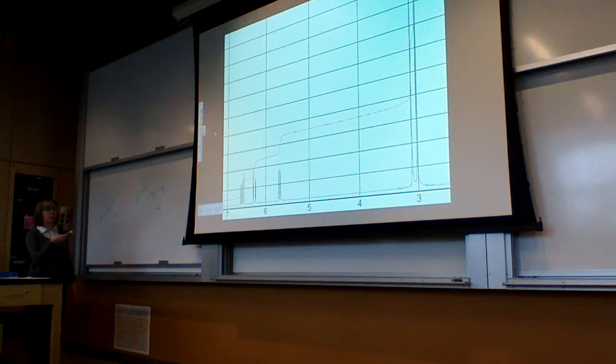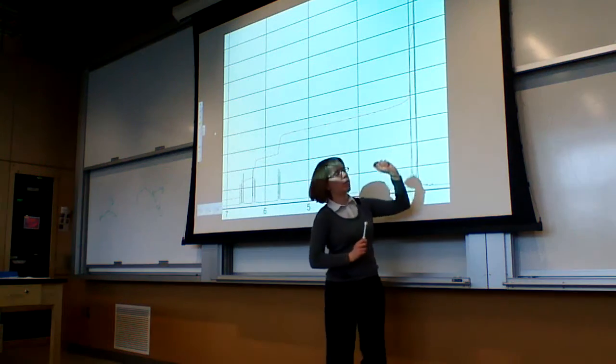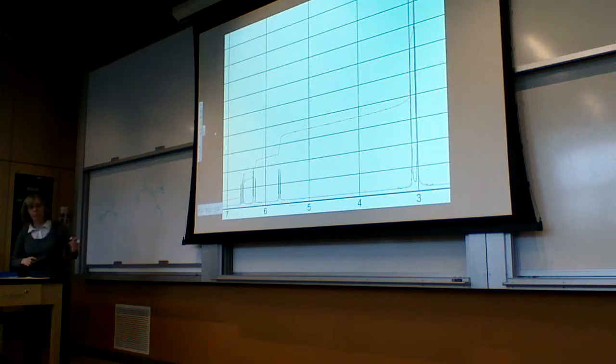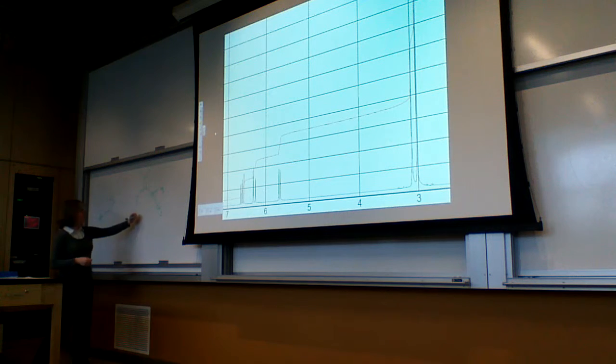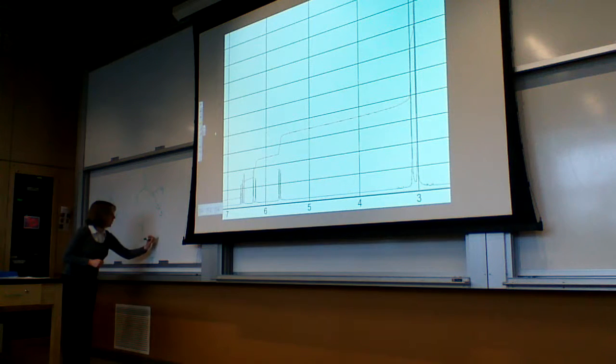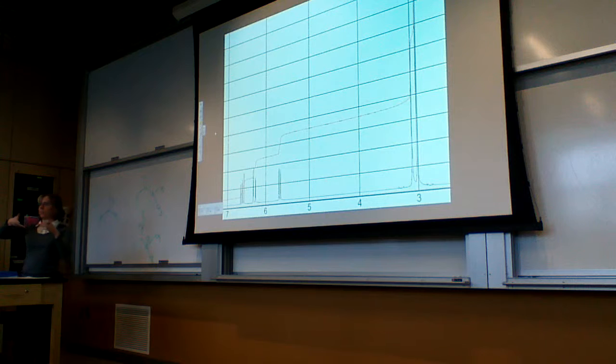But as you look at the spectrum, you're going to notice that there are actually two singlets right around 3 parts per million. These two singlets are actually the two different methyl groups on the amide group. On an amide in particular, we have a very strong resonance form, which we've seen in the IR when we were talking about amides, where the nitrogen takes on a positive charge and the oxygen a negative charge. And we get a double bond between the nitrogen and the carbon. Remember, double bonds cannot rotate.